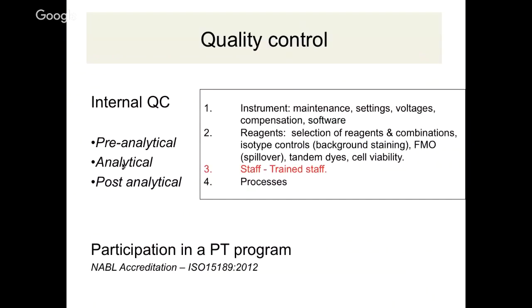So this is my last slide. Friends, you do flow, you do MRD, whatever you do, but you need to have good quality control in your lab. It's both internal control as well as external quality control. Participation in a PT program is mandatory. Accreditation has taken over in India in the last decade very aggressively. I'm sure in the West, most of the labs are accredited. You cannot have a lab without it, but in India, it's not mandatory. The labs need not be accredited. But if you are doing MRD, if you're doing high-end flow, it's very important to have trained staff, adequate reagents, maintenance of instruments, good technological support, and your processes in order.